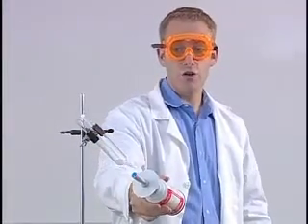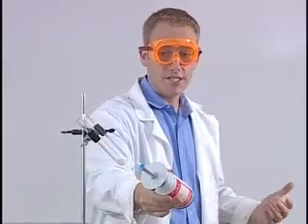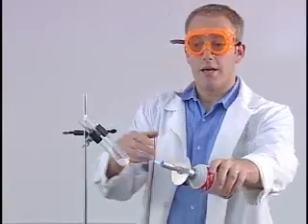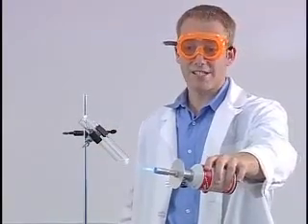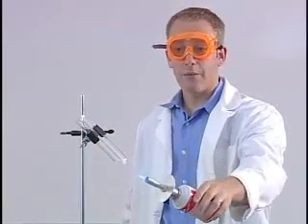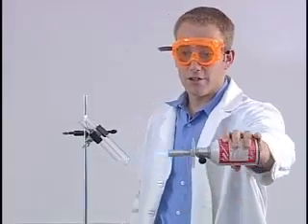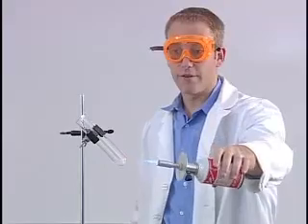Well, actually, gummy bears are made out of sucrose, which contains glucose in them. So the bonds of glucose have a lot of energy in them. Each bond represents a certain type of bond energy. And what's going to happen here is that bond energy is going to be converted into a different form of energy. Now, the reason I'm using gummy bears, I could really use anything, but it has to be small enough to fit into a test tube.